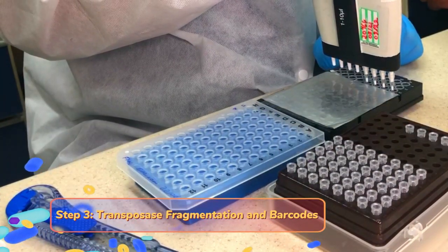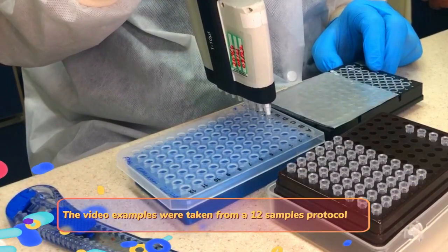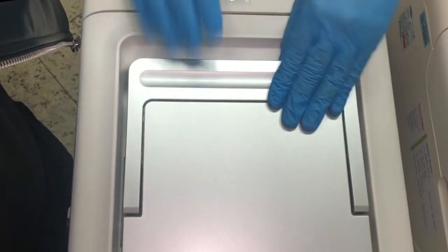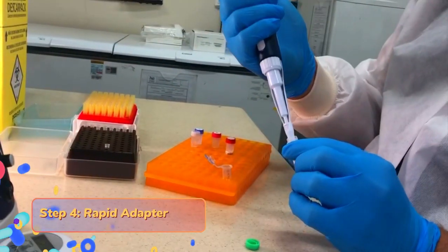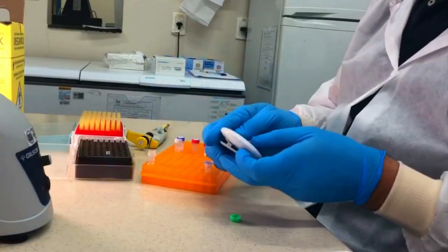The next step is to add the barcodes from nanopore. Add 2.5 microliters of the fragmentation mix from the rapid barcode plate to the PCR tube containing the diluted amplicon. This is a very quick step — it takes only two minutes in the thermocycler. Be prepared to continue the protocol. After that, add 1 microliter of rapid adapter reagent from nanopore to the library and incubate at room temperature for 5 minutes. The library is ready to be sequenced.